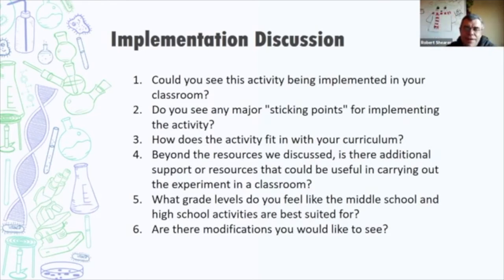I think your high schoolers might want to push for more interesting chemicals, you know, and it would be interesting if there were some chemicals given to them that you knew ahead of time were going to spark unexpected germination or unexpected growth, because they're probably going to predict, oh, all this stuff's going to kill it, and then suddenly it's like, wait, no, whatever this is, it's doing something surprising.